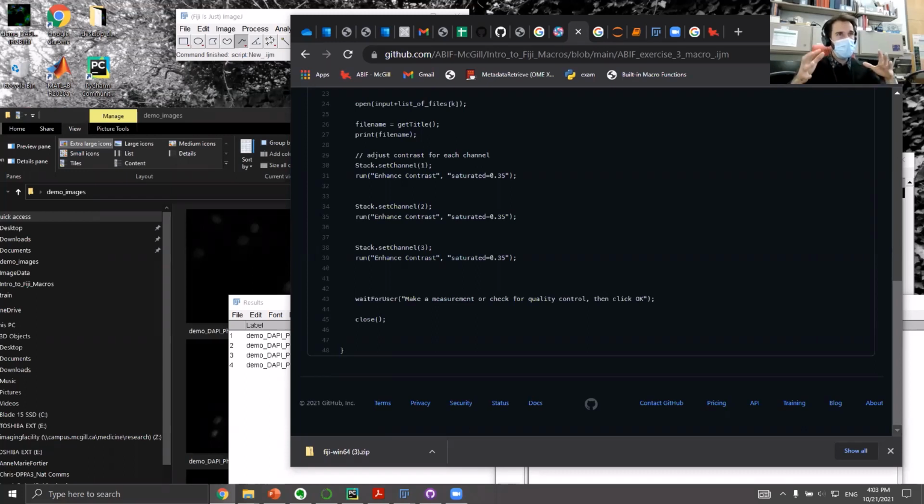What we tried to do is really keep it on the practical side of manipulating images, and not just starting with, oh, a variable can be 2 and 2 + 2 = 4 and stuff like that, which is really cool for computer science type approaches, but I think we want to get you going with modifying images as soon as possible. And through that, if this is interesting, then you'll develop a sense for it, and figure out where you can be tricky, where you can be clever to convince the computer to give you the information that you want.